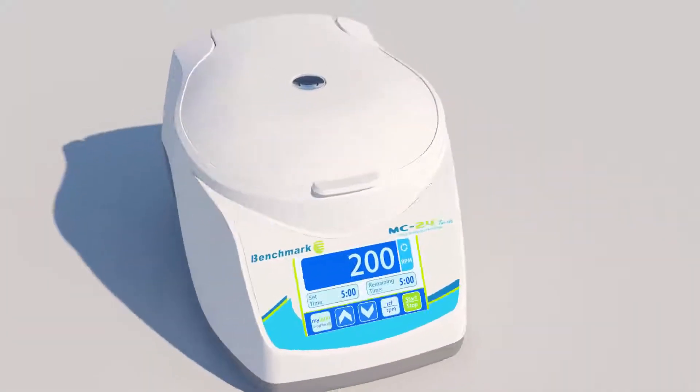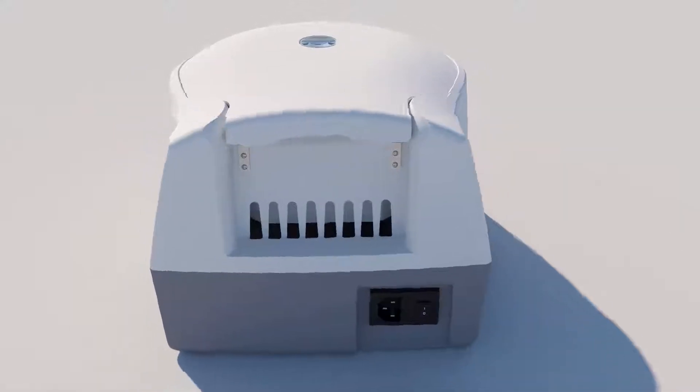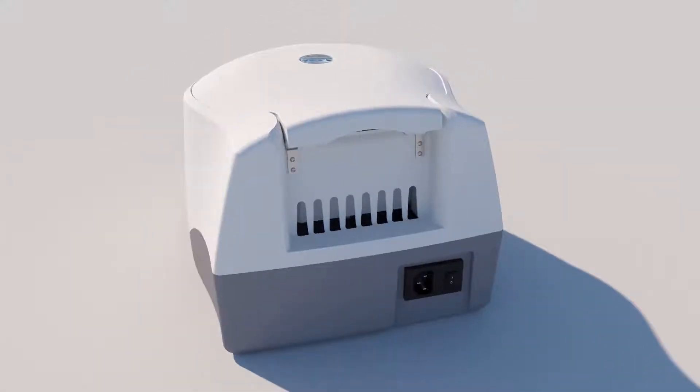Benchmark's MC24 Touch is a compact, air-cooled microcentrifuge designed for molecular biological applications.